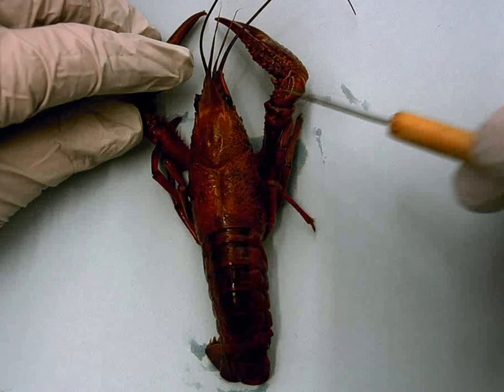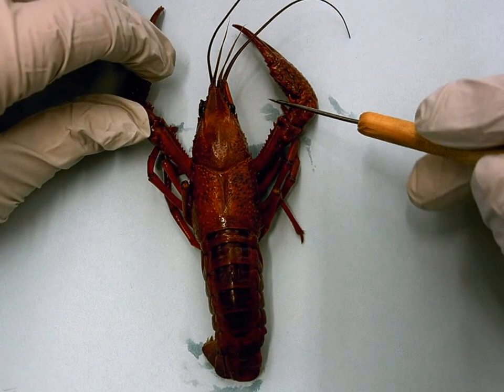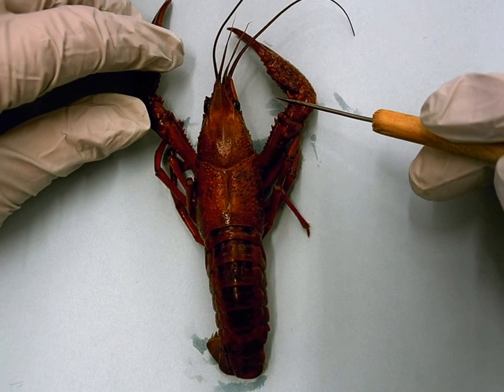This is part one, external anatomy. The first thing it asks you to do is identify the major external features.